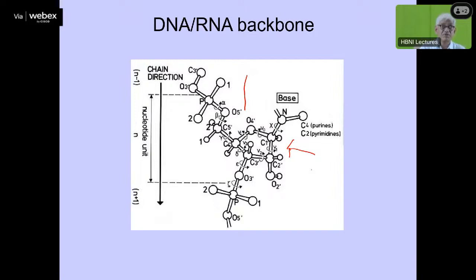There are two kinds of 5-membered ring. There is a 5-membered ring here. There is a CH2 group here. From here there is a CH2 group. This CH2 group gets connected to the phosphate here. There is a phosphate, then a CH2 group, then a 5-membered ring here, and of course this continues in the same manner.